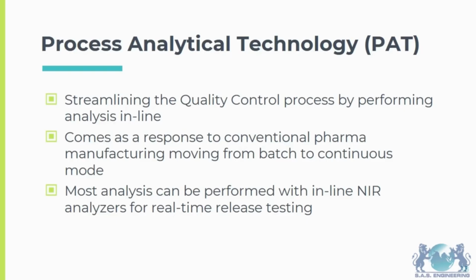So, in order to overcome this problem, we may be able to streamline the quality control process by performing all of our analysis inline instead of offline. So, this is a relatively newer concept called process analytical technology, PAT.